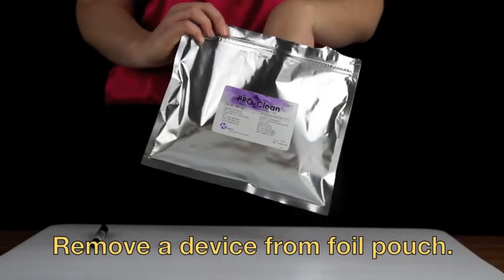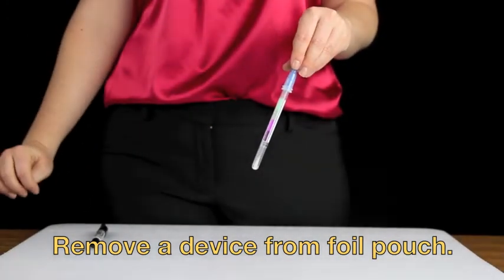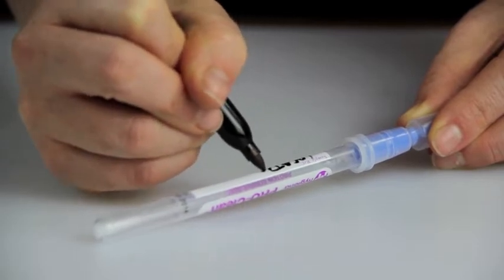Remove a device from the foil pouch. You may choose to write the test location or time of the test on the label for easy identification.